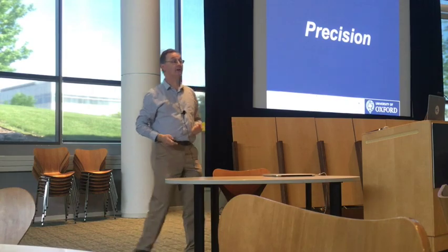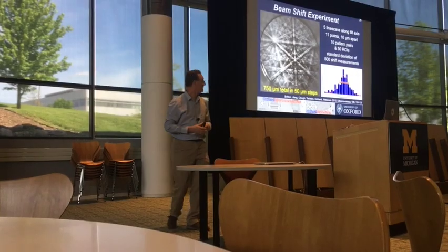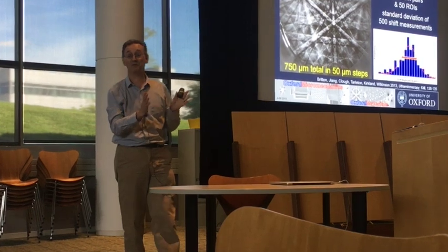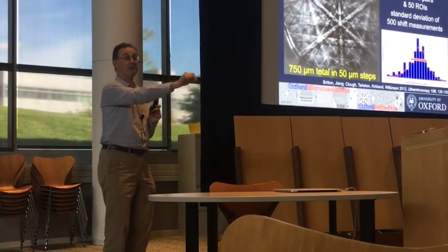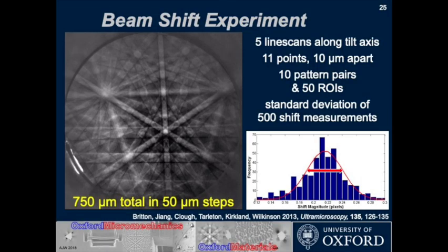That's just geometry. And so the simple experiment that we came up with, we're trying to measure this, is to take a really boring, perfect bit of silicon, put it in our microscope, and simply move the beam across the sample. If we move the origin of our pattern spatially across, then the pattern itself has to follow with it.